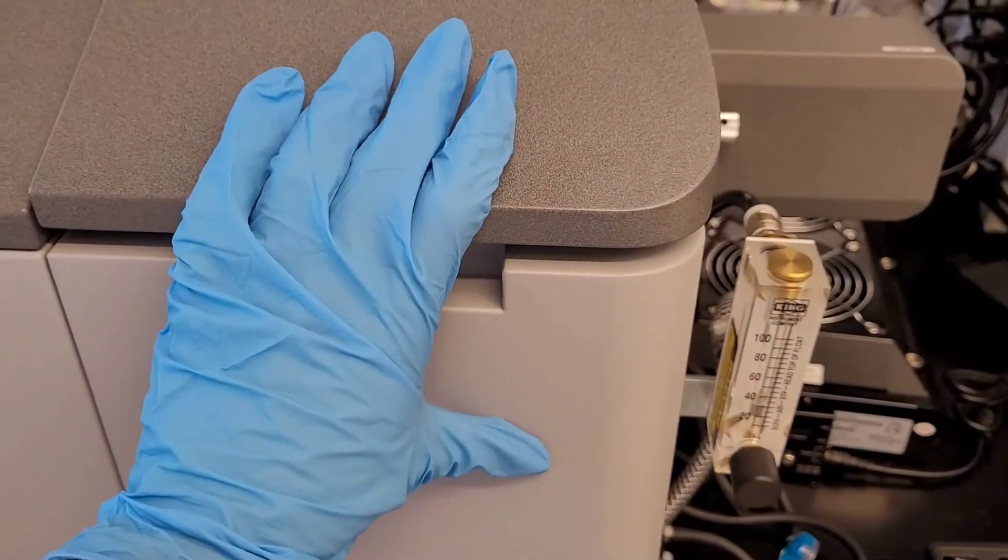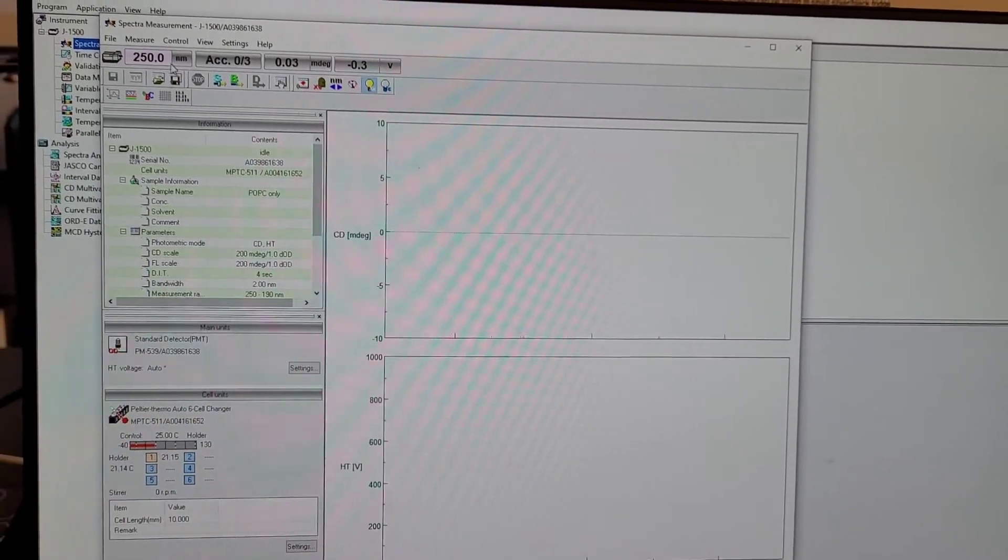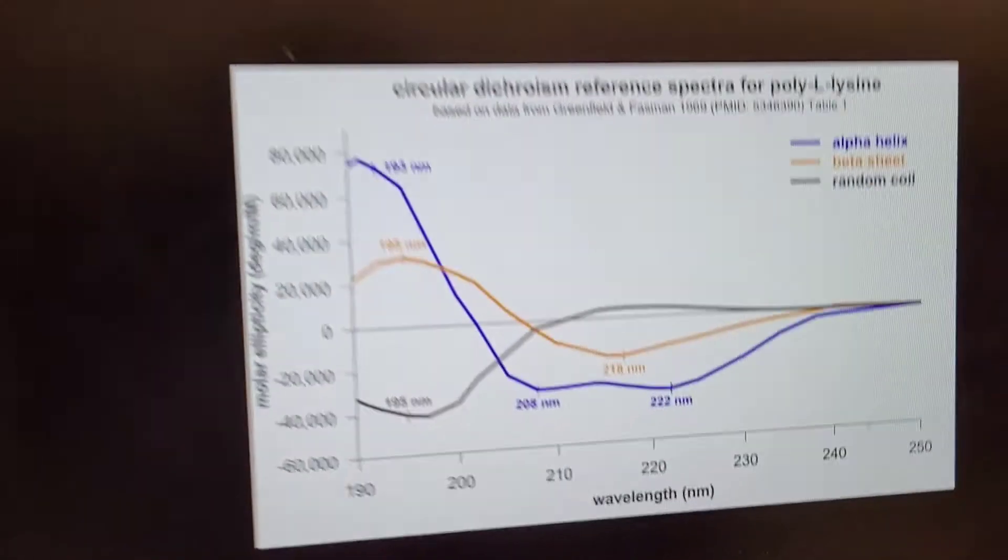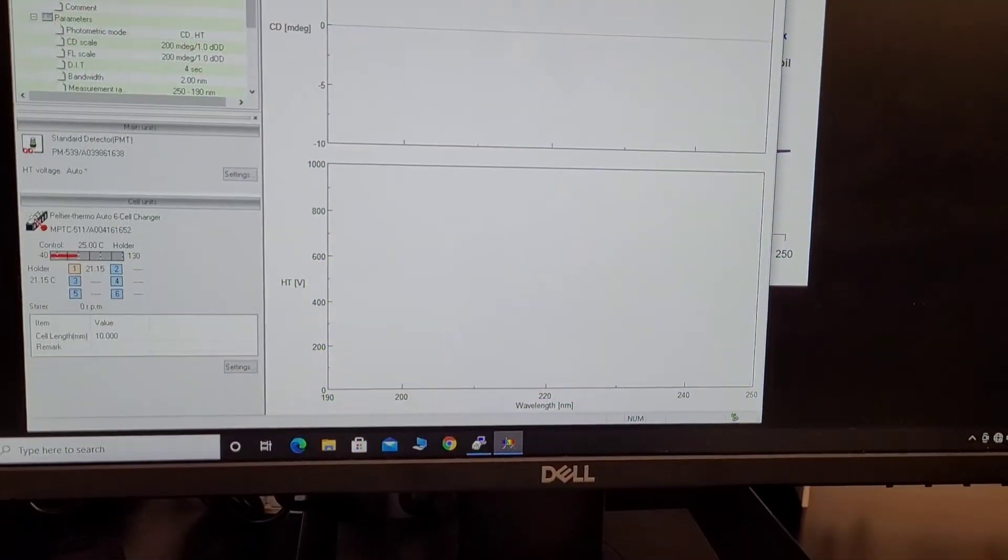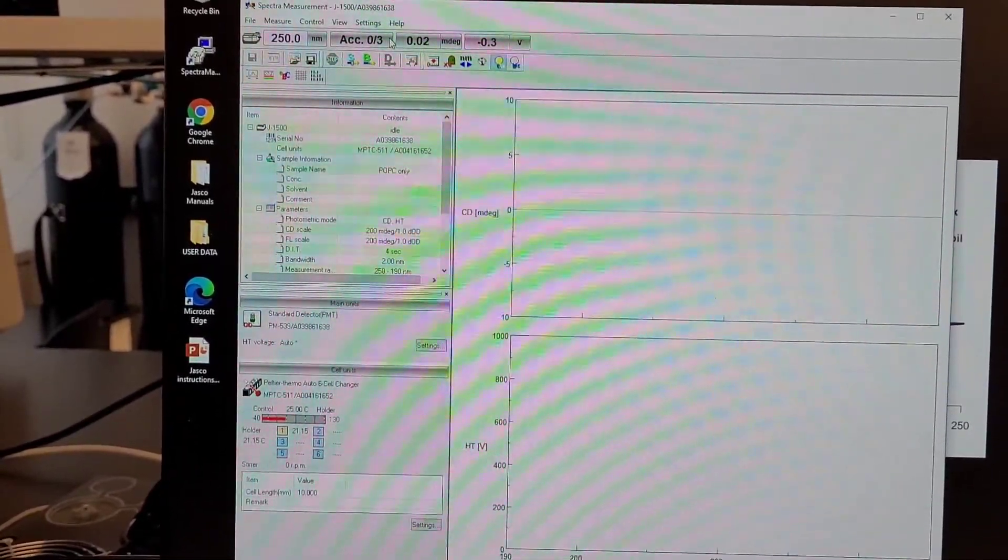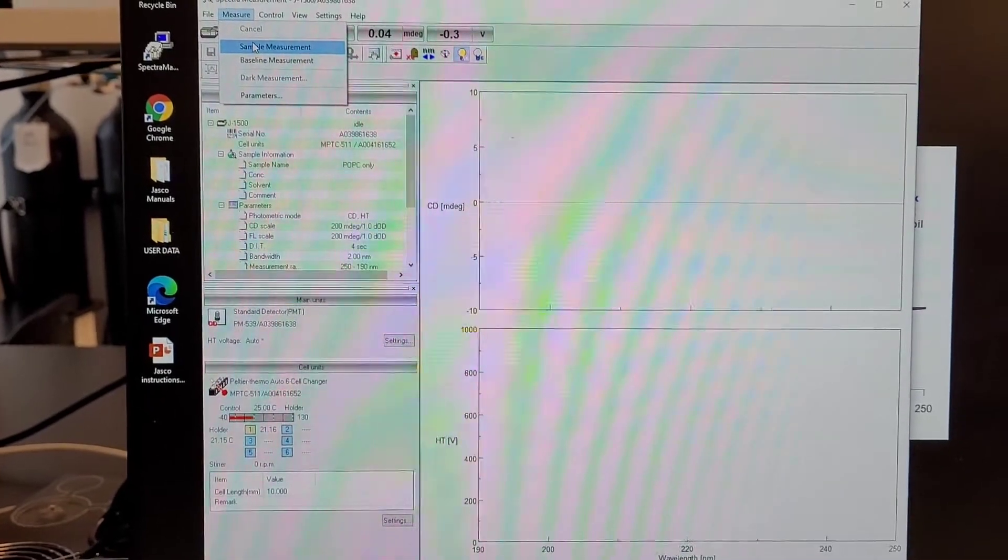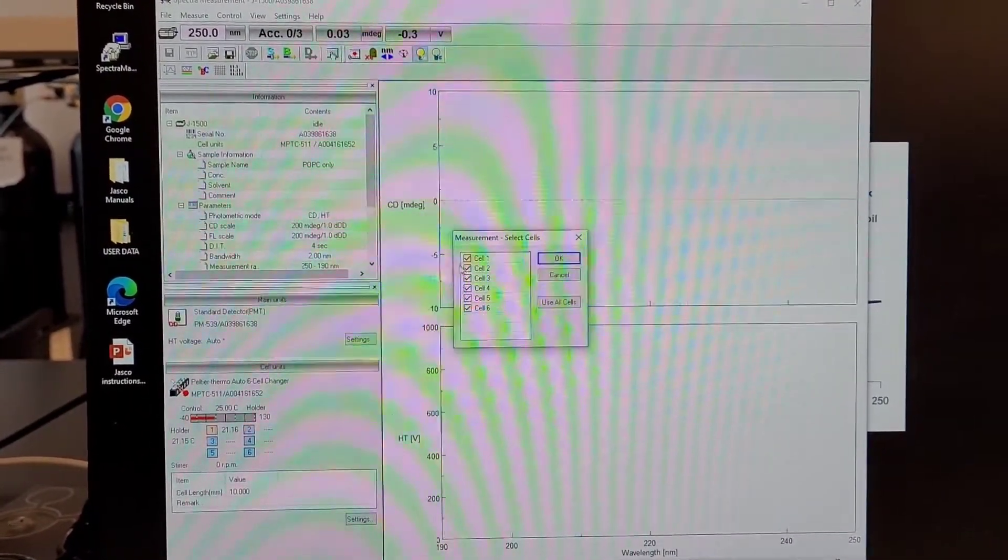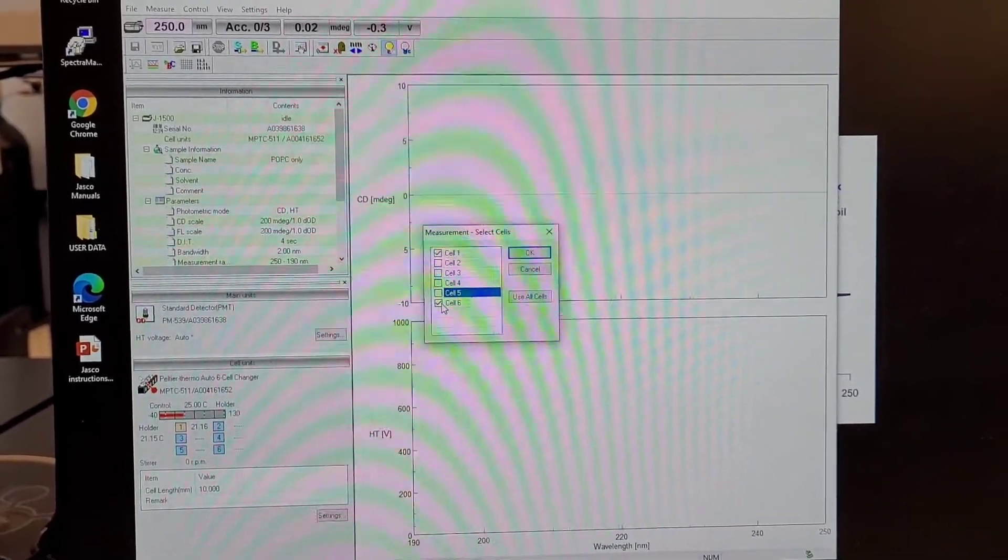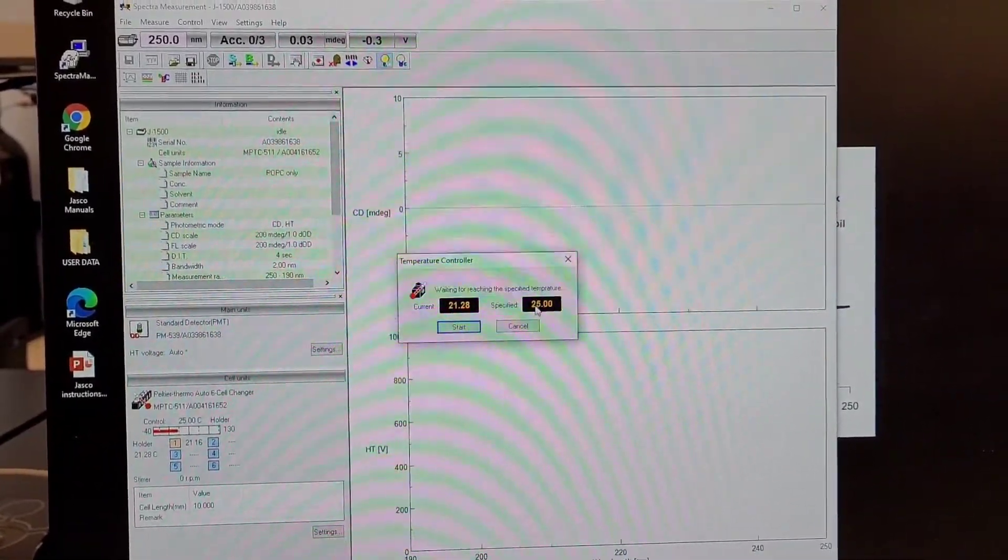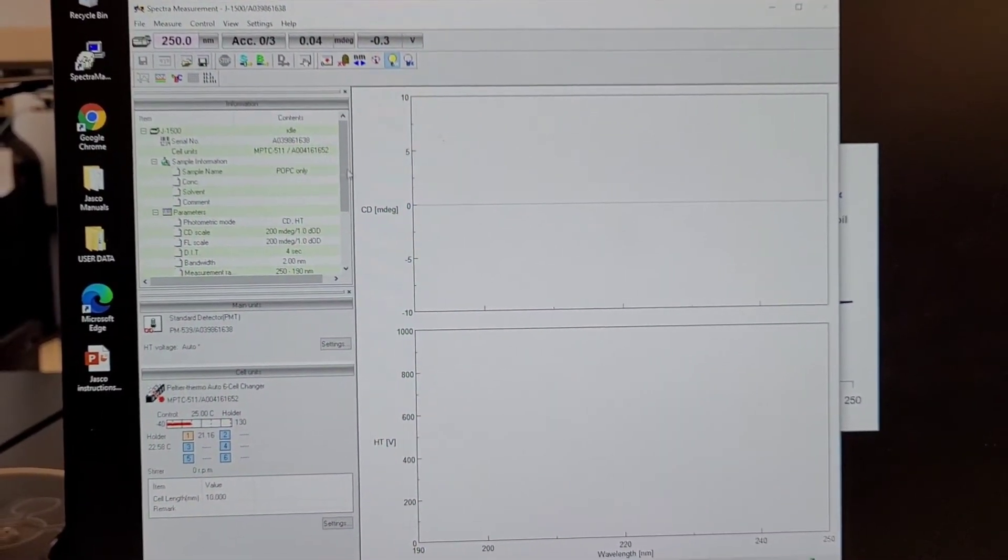Make sure it's completely closed and then you can choose the wavelength range that you want. Usually it goes from 190 to 250, so this is a good range and usually it is just what everyone does. It's good to do three reads. Today we're doing a simple measurement so I'm just going to select sample measurement. I don't need a baseline now. Select cell 1 because that's the only one I have sample in. Then it's going to start.